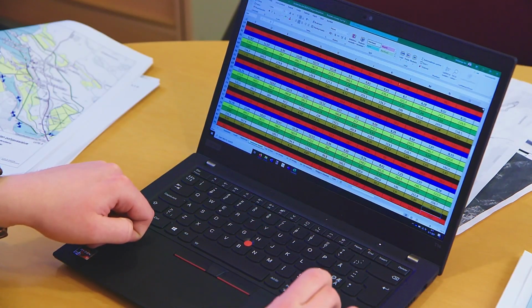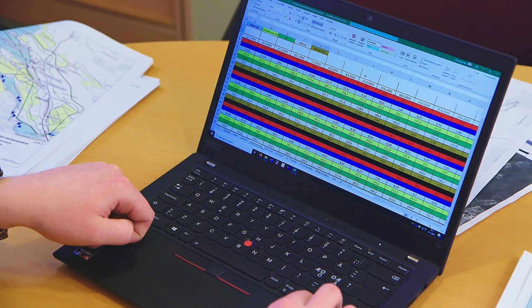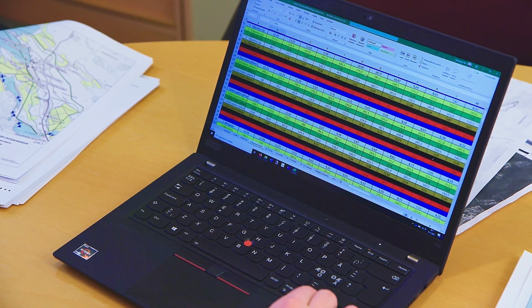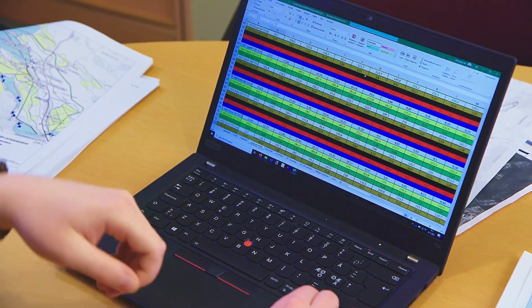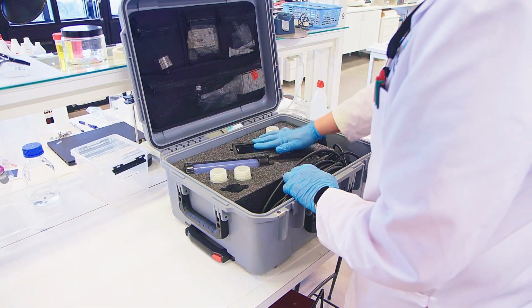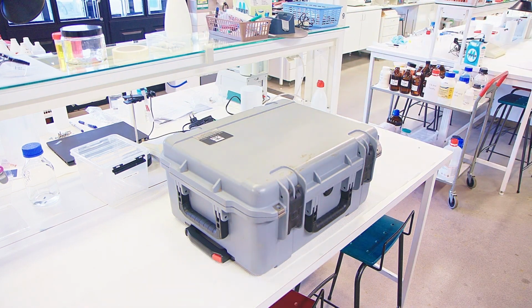Since measurements are easy and quick to take, and one measurement can provide up to dozens of measurement parameters, even one field visit will provide a lot of measurement results. Often this means the statistical review of the results and the processing of large volumes of data. The person processing the results should also be able to examine the results critically, know the measurement uncertainties of the meters, and remove any measuring errors from the results. The equipment should also be maintained after use so that it is ready for the next measurement session.